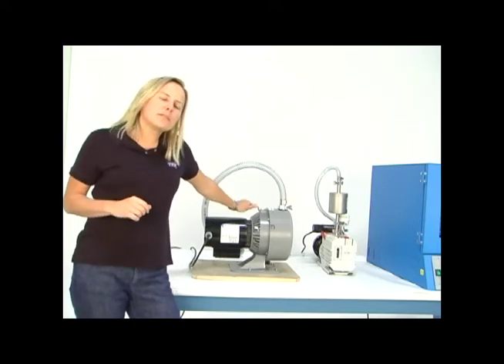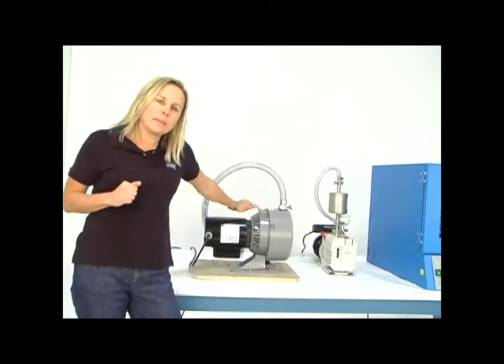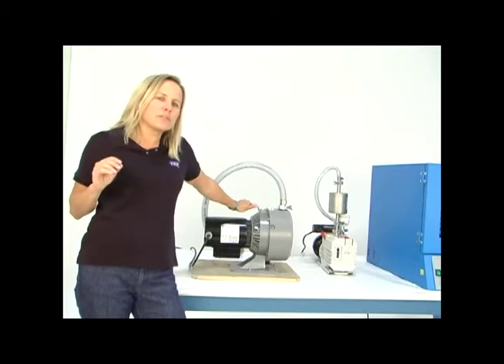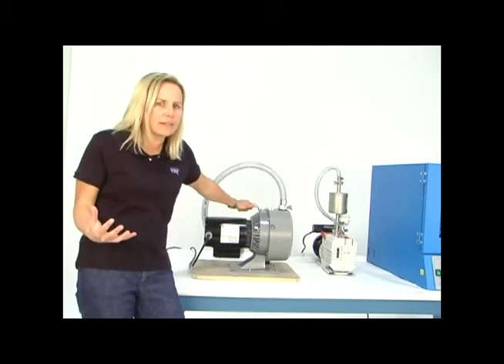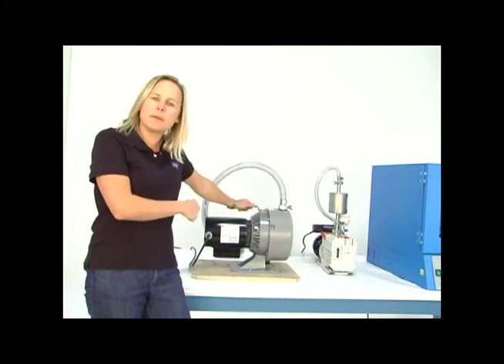Dry scroll pumps tend to be a little bit more expensive than an oil rotary vane pump, and they also tend to not do as good of a job handling large amounts of water, acids, solvents, things like that. But for a super clean environment or clean room, this type of pump is the way to go.